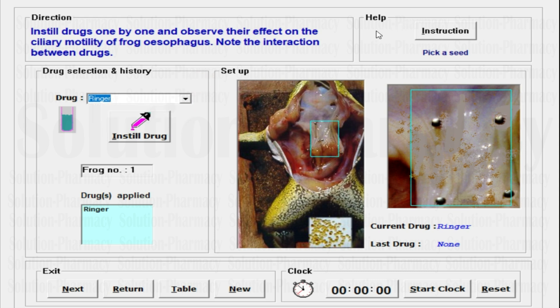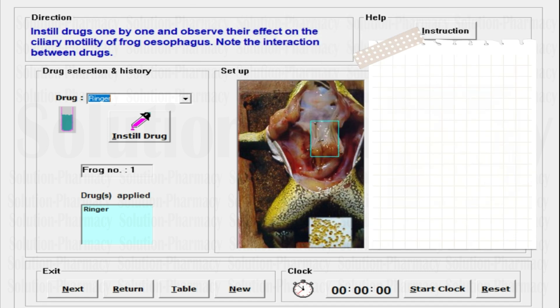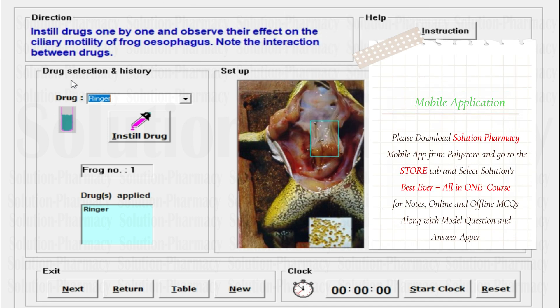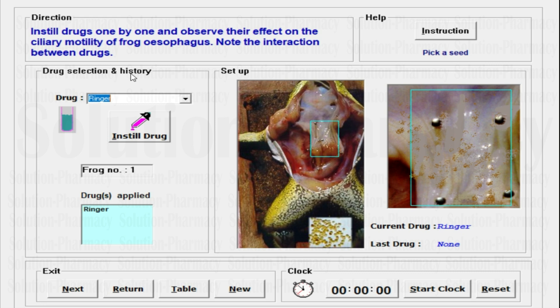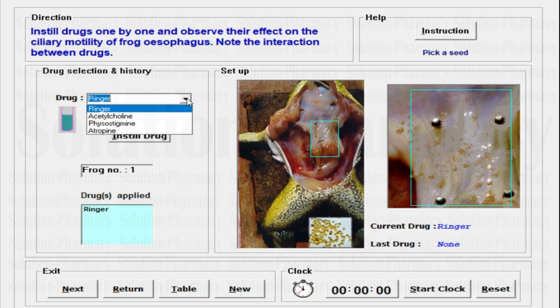Next to the direction point, you will see the Help menu where you will find instructions to follow one by one. You need not worry about the procedure — the app will explain it by itself. As per the instruction, it says pick a seed, but we have not instilled any drug yet, so we are not going to pick a seed. Next tab is Drug Selection and History. We have to observe the drugs listed in the drug tab and study the history. These are the drugs: Ringer, that is frog Ringer solution — a physiological salt solution.